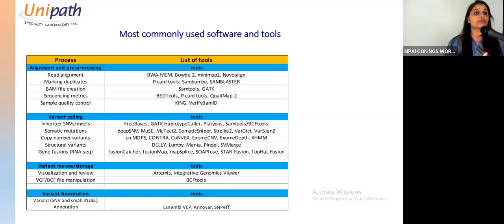You feel that the variant has been covered very nicely, that 213 reads are representing the variant. But the other duplicate reads don't add anything to that, right? So you first need to remove the PCR duplicates. There are very advanced tools for that. You remove the PCR duplicates, then you get the new file, which is processed again, and that is used for variant calling.